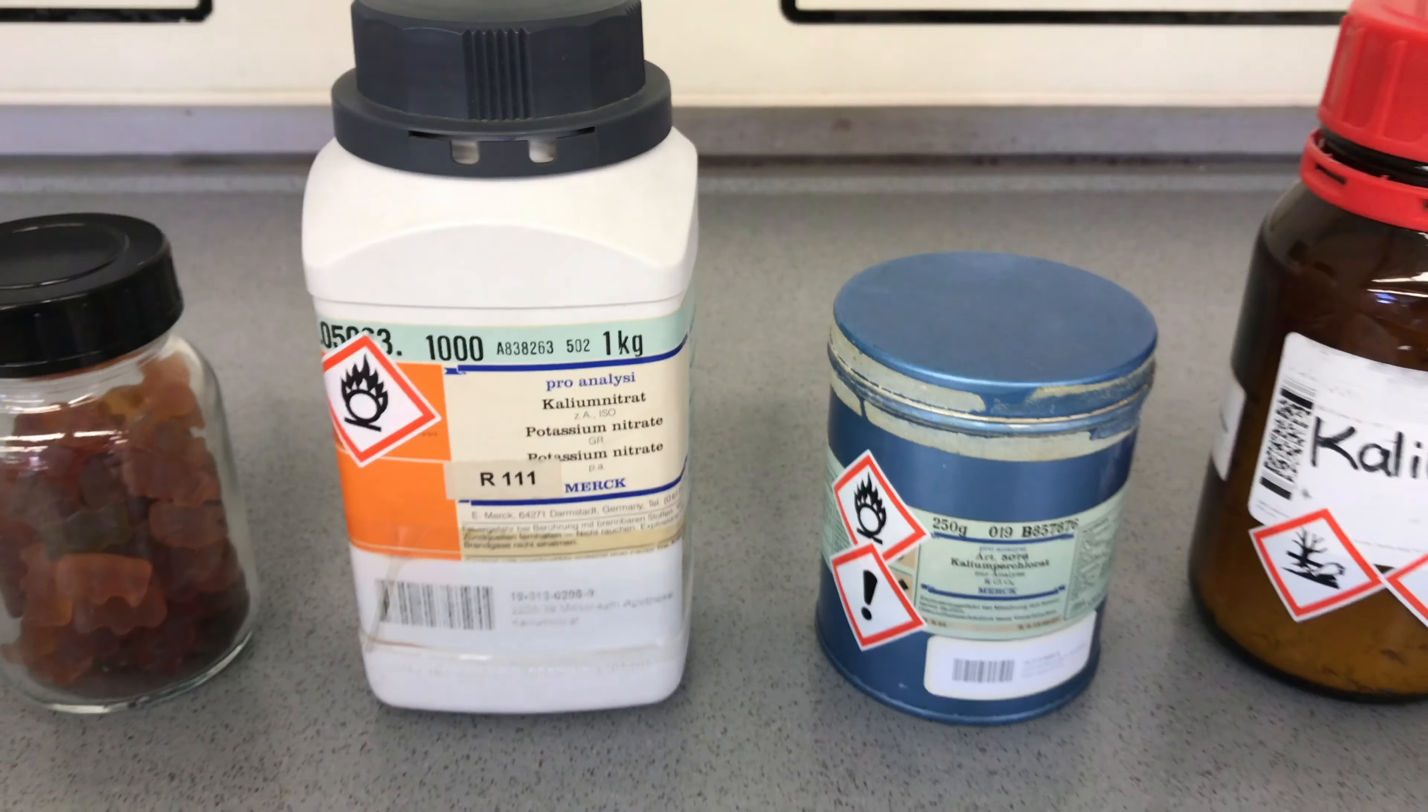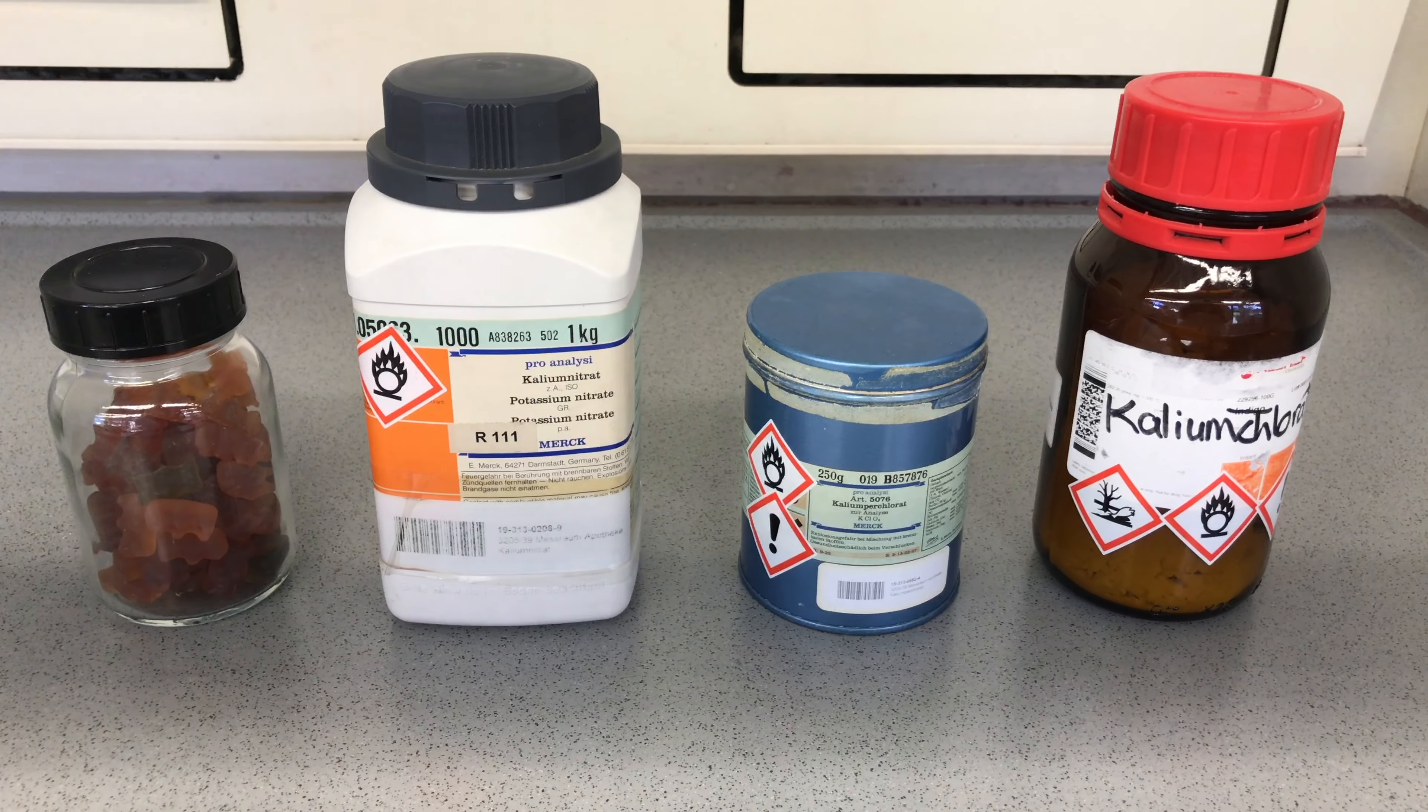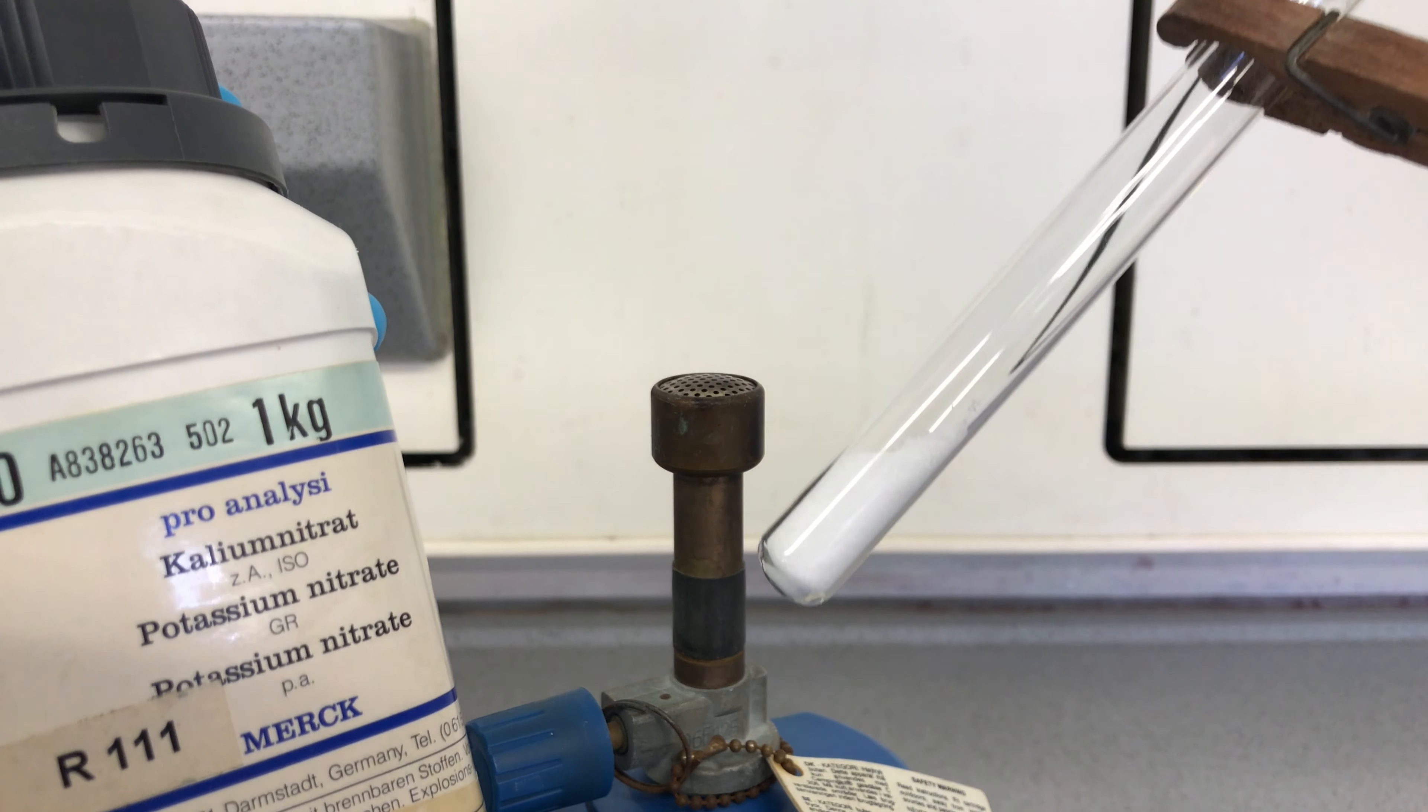Today we are going to drop a gummy bear into some molten oxidizing agents. Let's start with potassium nitrate.